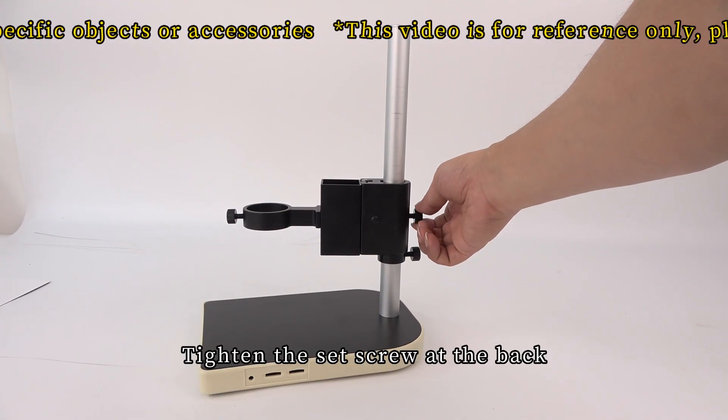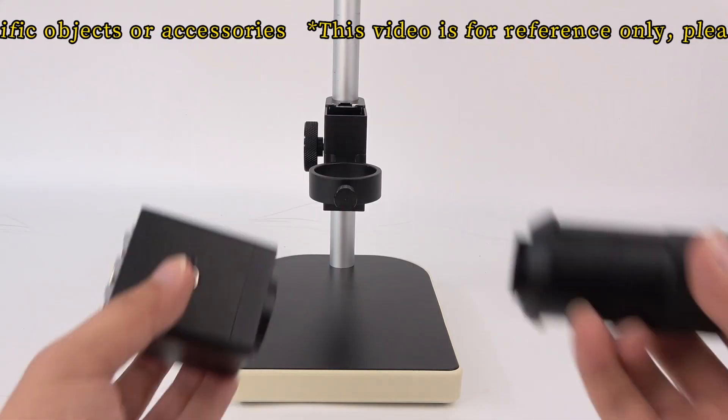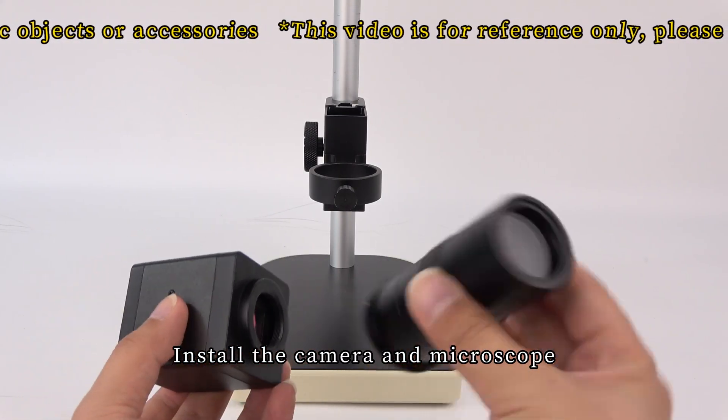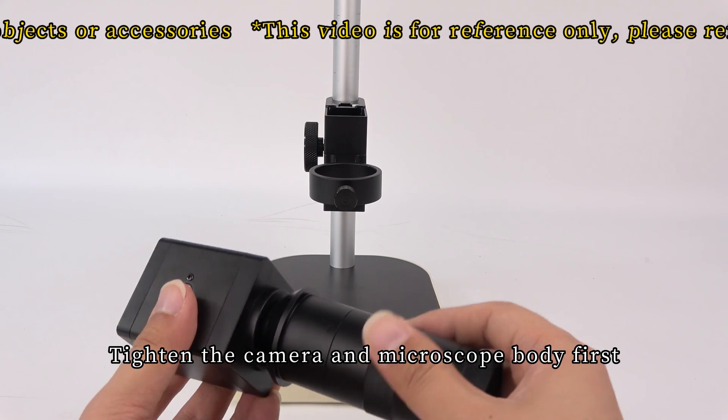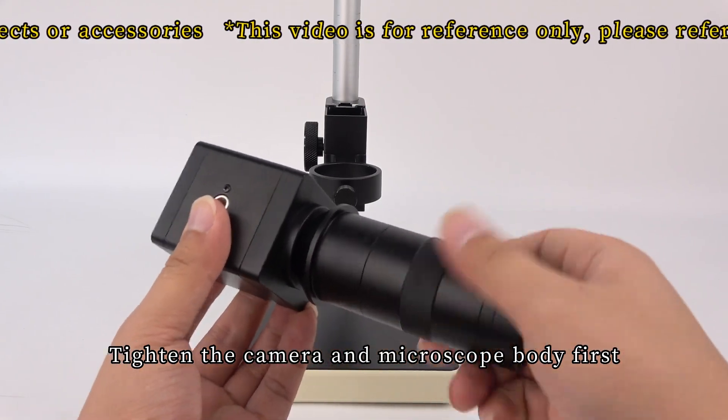Tighten the set screw at the back. Install the camera and microscope. Tighten the camera and microscope body first.